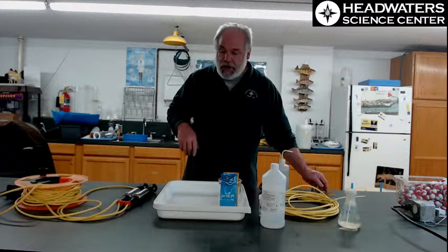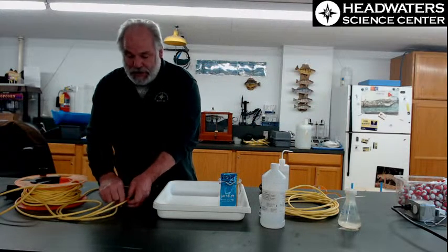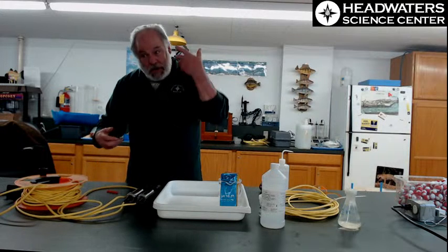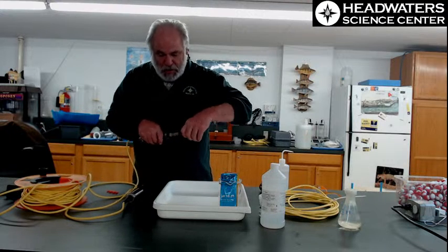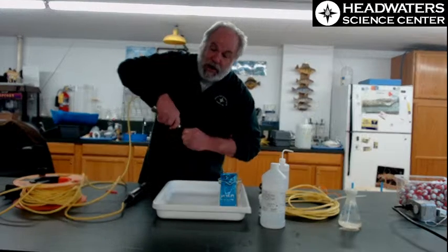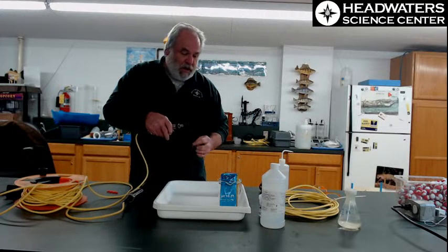All right, well, let's look at that, because we do have to indeed calibrate our instruments every time we go out for a day's worth of sampling. We like to have our instruments calibrated, and we're calibrating so that we can come up with 2 kinds of assurances. And the 2 assurances we're most interested in are accuracy and precision. They're slightly different. Sometimes they get thrown together.